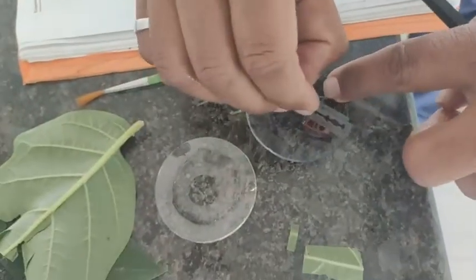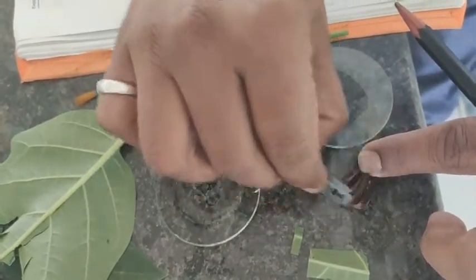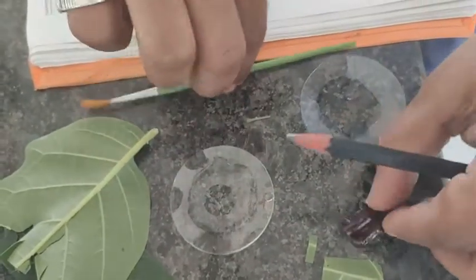This sample was very hard, therefore we cannot cut it easily. Therefore the first procedure is boiling. After that comes cutting the section. After cutting, transfer the section into the watch glass.